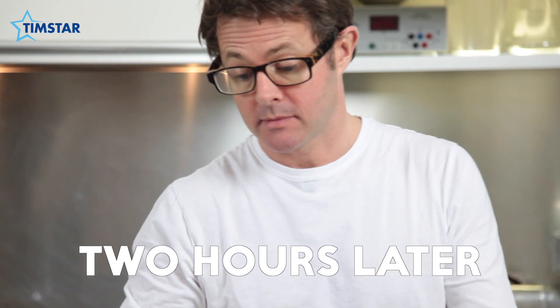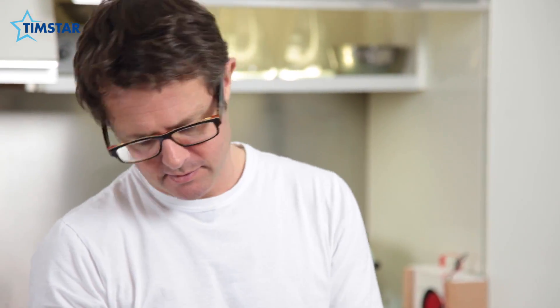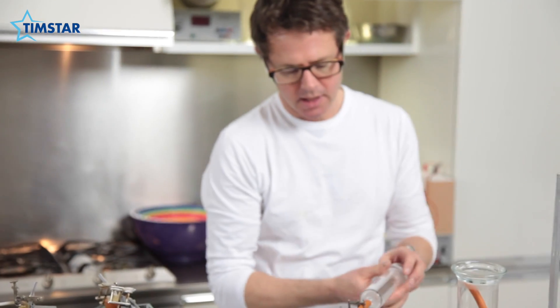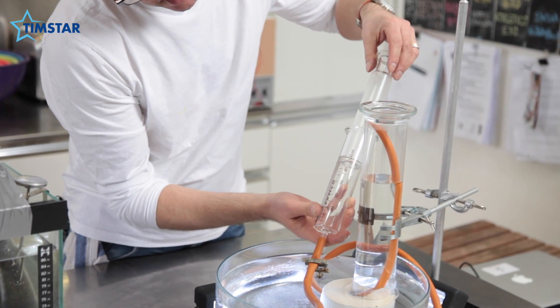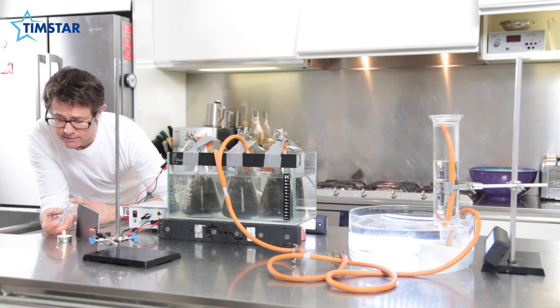Freddy has been digesting anaerobically for a little while now, so it's time to vent him. What we need to do is draw some of his gas off — he's basically going to do a fart. I'm going to collect the gas in this absolutely beautiful gas syringe. First of all, undo my little Hoffman clip here, and then I'm going to draw off a hundred millilitres of gas. That's pretty good. This is a huge amount of absolutely beautiful lab kit, and I think there's only one way to justify using it all: to see if we can light one of Freddy's farts. So what I'm going to do is eject the gas over a naked flame and see what happens.